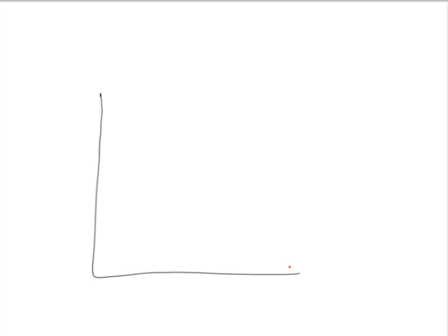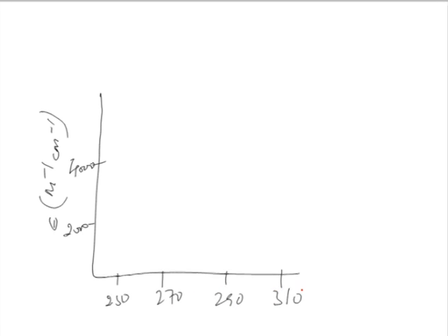For example, in terms of pH, if we are having the molar absorption coefficient or epsilon in particular units, and there are particular wavelengths here, now if I consider the two pH values, pH 6 and pH 13 as I was talking about, then there is a particular difference.